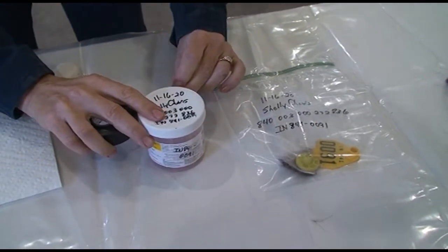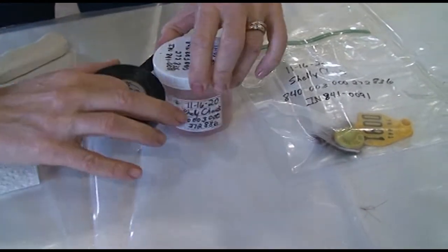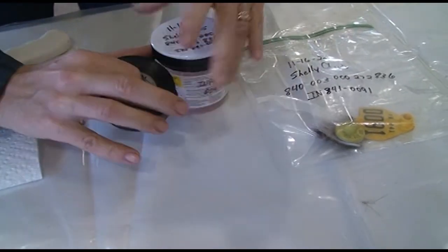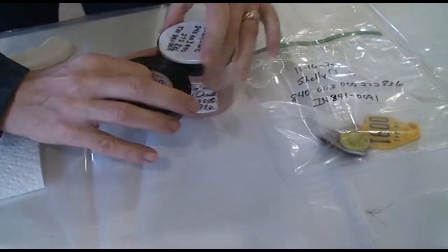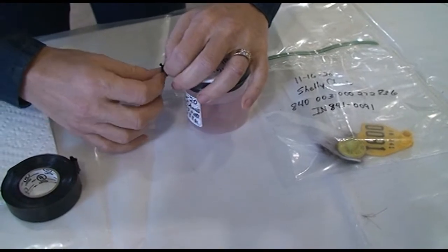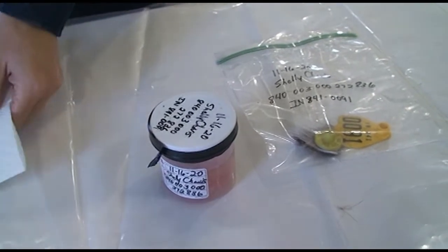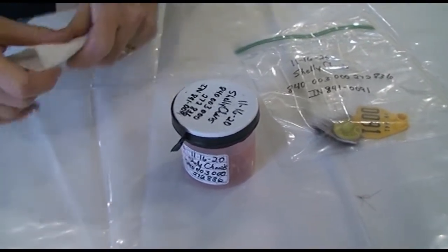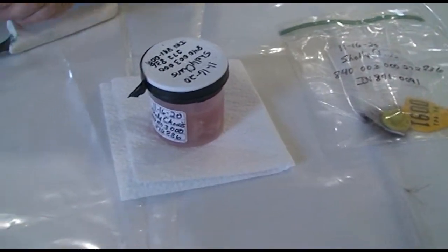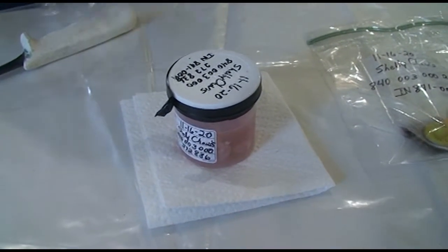And the formalin jar, you put it on as tight as you can, and then you put electrical tape twice around the lid, because no matter how tight you put that lid on, they still can leak formalin, and because it's considered a caustic carcinogenic substance, we want to prevent as many leaks as possible. So we electrical tape the formalin jar, and then you have to put it into 2 Ziploc bags. We put some paper towel underneath it so that if it leaks, it has the paper towel to absorb any of the formalin, and it doesn't drip.